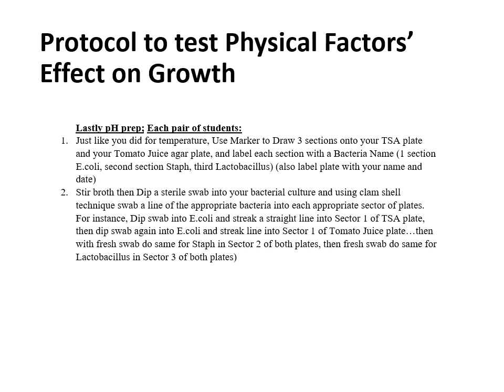Then you set up the same bacteria on a tomato agar plate. So there's tomato juice in that plate. And the reason we do that, if you think of tomatoes or tomato juice, what do you know about its pH? Well, it's acidic. That's why some people get heartburn after eating tomato sauce or drinking tomato juice.